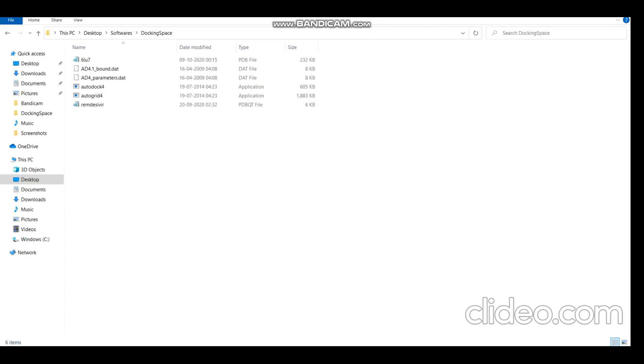So now I have all the required data for docking: the PDB file for the protein and the PDBQT file for the drug that I retrieved using OpenBabel.